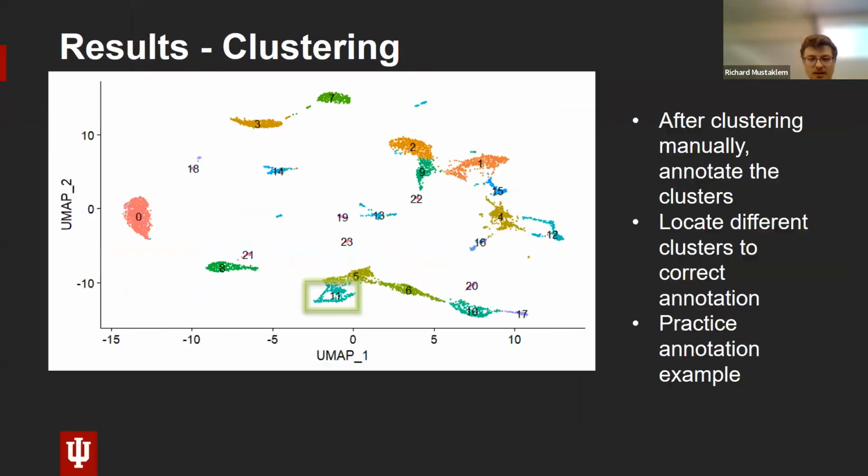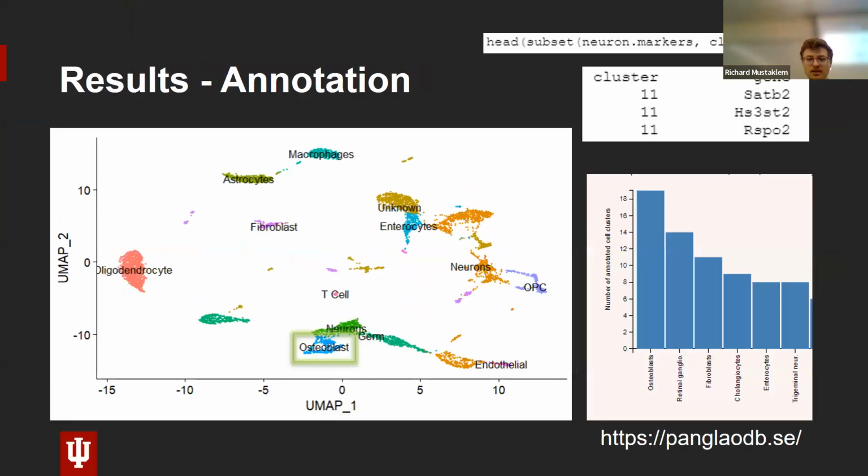So we did all of this work for this image. What we can tell from this is where we finally sit down and try to make biological inferences. We can see that oligodendrocytes are very separated from everything else. So what does that tell us about the genes? Well, that tells us that oligodendrocyte gene markers are very diverse from the rest of the group.